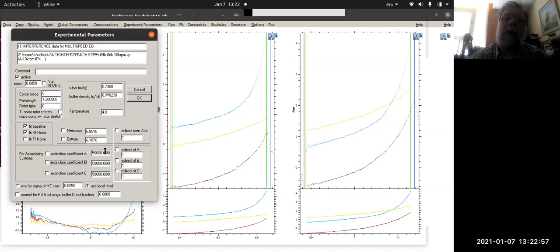The only reason we actually do that is, for instance, if you're trying to measure the extinction coefficient of a known concentration of a species, and you're measuring it at a wavelength where you don't know the extinction coefficient. So it might be worth trying to fit there. And there are examples for that on the analytical ultracentrifugation website, not this workshop's website, but the one at analyticalultracentrifugation.com.